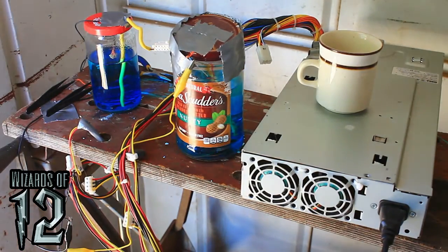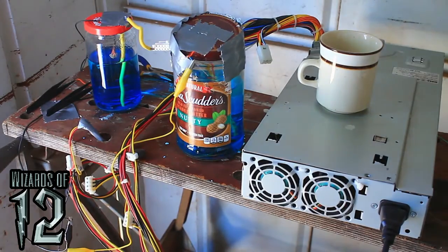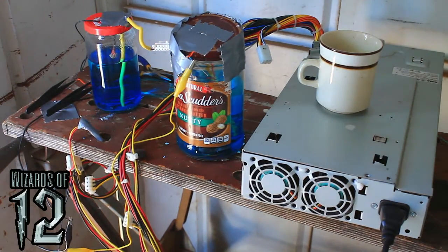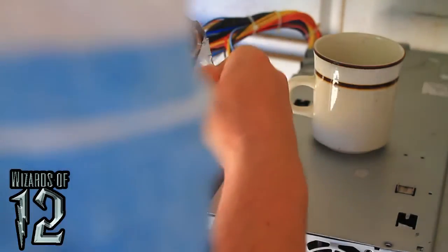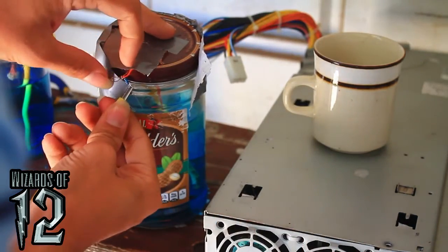This one in particular — I have to harvest it right now because the positive electrode is about ready to break off. It looks to be a pretty interesting shape and size. First I'm going to get all this duct tape off of here and disconnect the negative lead.